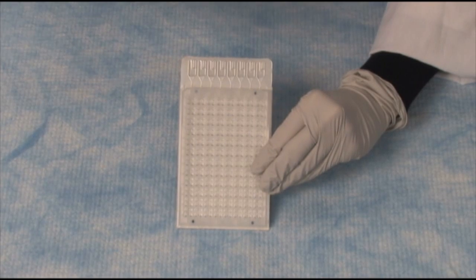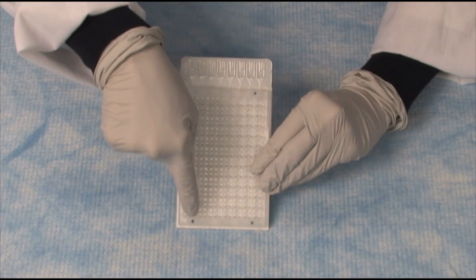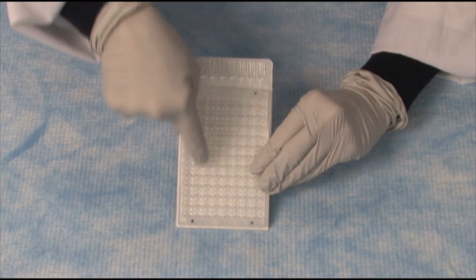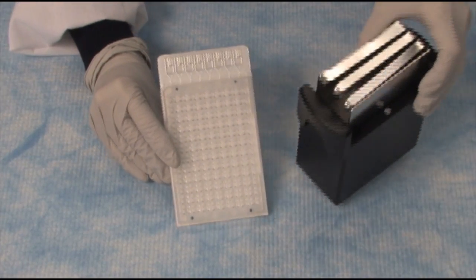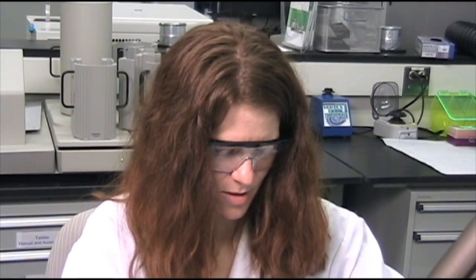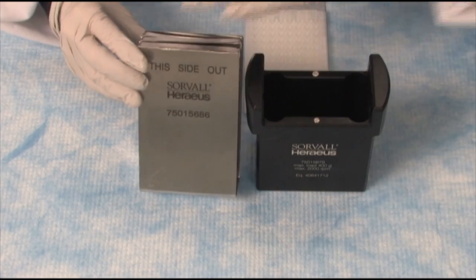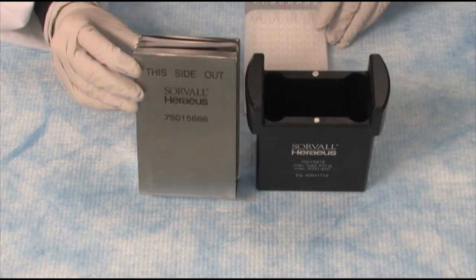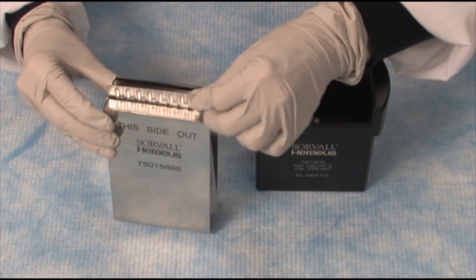The liquid, once it's centrifuged, will go down this little port and fill all 48 wells for each of the eight ports. The way we do this is we bring in our centrifuge holder. I'll move the card so you can see this — it's very easy. We place the card in with this side out, and then simply centrifuge it so that the liquid fills in all of the different holes.